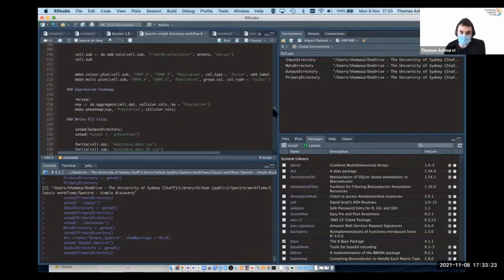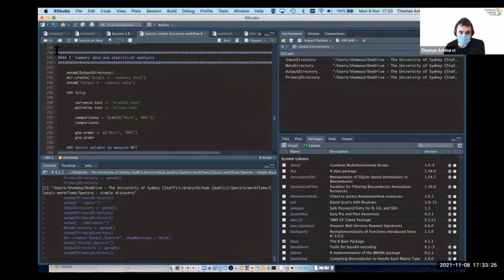Once we've got the annotations, all that's really left to do is to summarize the data. Essentially, this is quantifying various aspects of the data and then doing some statistical analysis on it. In this case, we calculate all kinds of metrics simultaneously: the proportion of cell types that we find in each sample, the actual cell counts present in each sample, how many cells are expressing a certain level of one of a number of markers, all of these things that we would normally get in FlowJo in, say, the table editor.